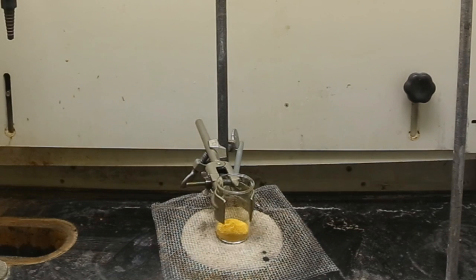The major avoidable loss of product was due to the fact that I did a double recrystallization, where, in my opinion, the water recrystallization was almost useless. My recommendation is to only do an ethanol recrystallization and forget about a water one altogether. Because we're simply dehydrating the P-Nitroaniline, the purity of the product isn't too important. If you need a pure product because you want to run another reaction with it, you're going to either need to do a second ethanol recrystallization or simply run a column.